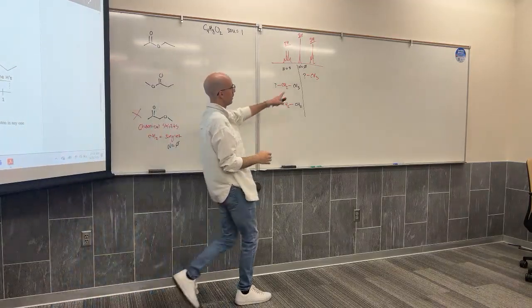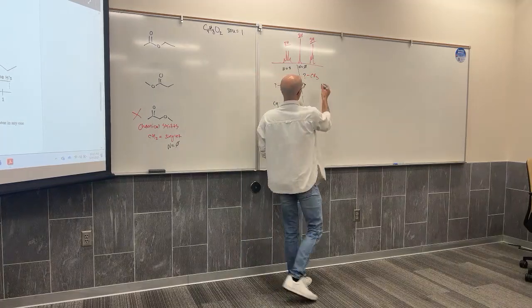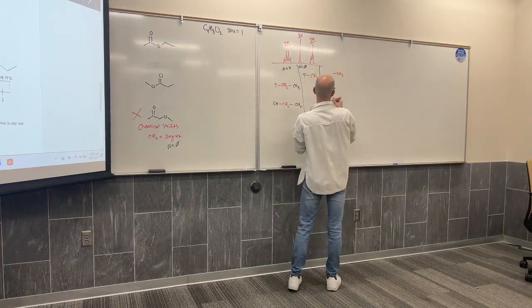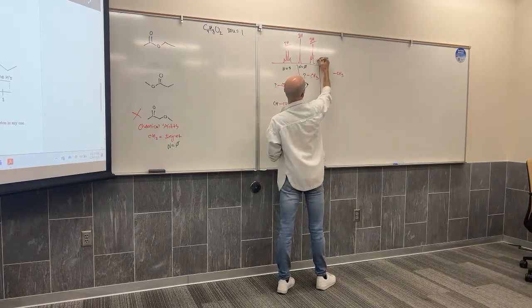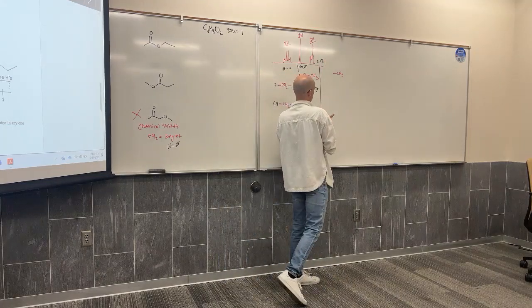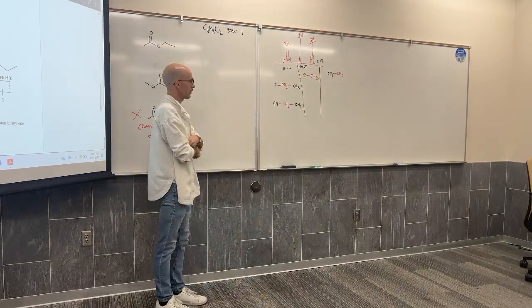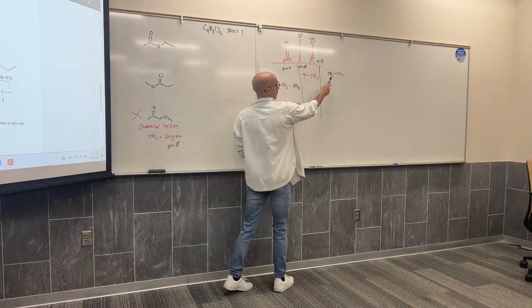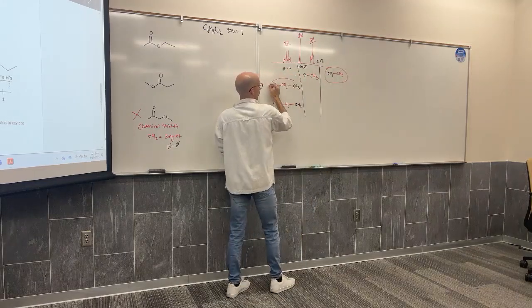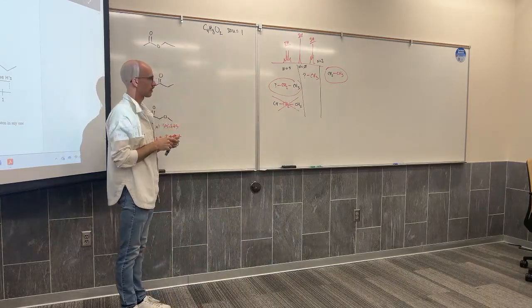So I don't know what's next to it, but it doesn't have any hydrogens, and it might be a functional group. And then my last one is a CH3 with how many neighbors? How do we know that? 3 peaks. 2 neighbors, so that's a CH2 group, which means this actually supports this structure and confirms that we don't have this structure on the bottom.